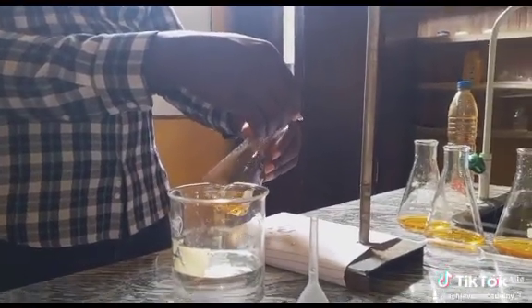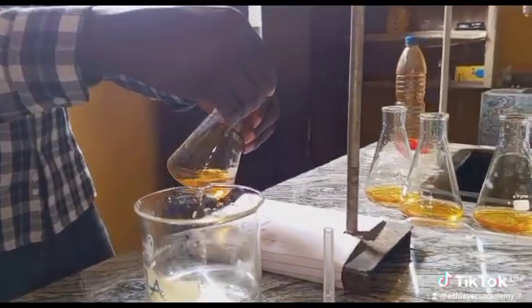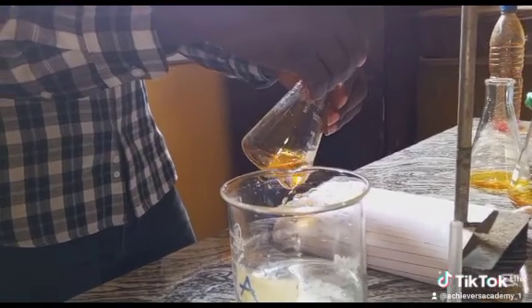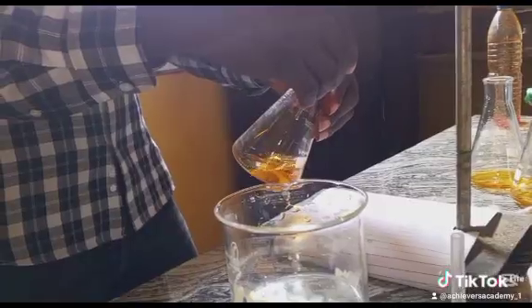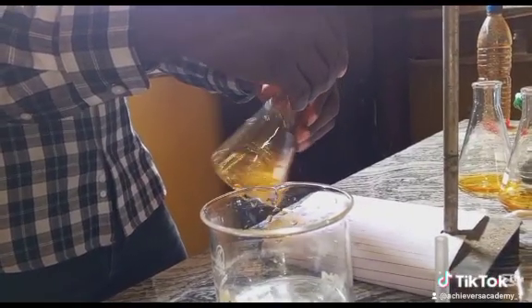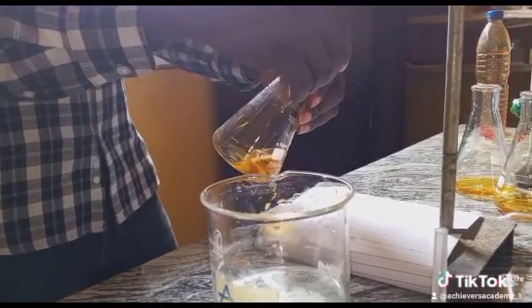Is it appearing to change? No. Are you sure? You are not seeing anything in form of pink color? Yes, sir. It is appearing to change. And at the point where you are suspecting that you are nearing the end point, you take it drop by drop. If not, you will over titrate it.